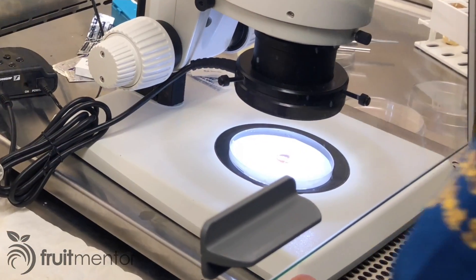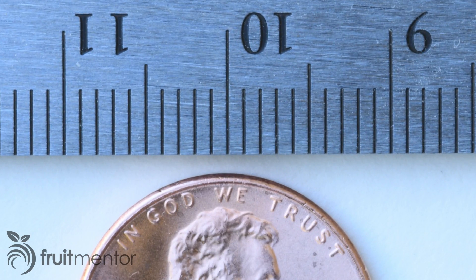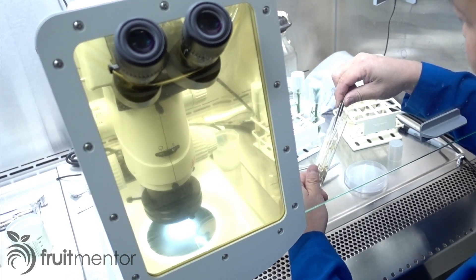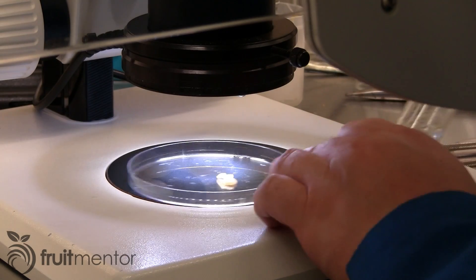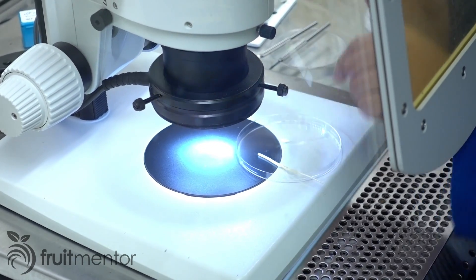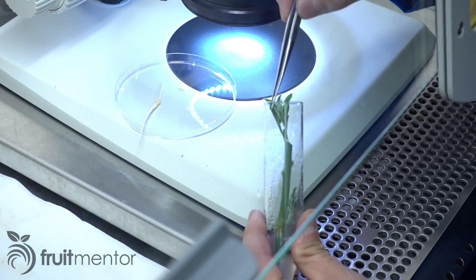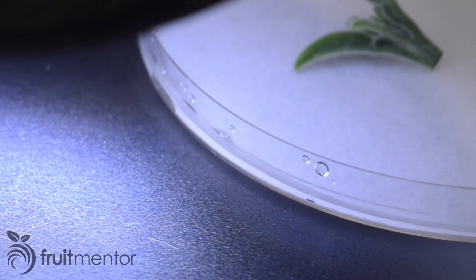A United States penny will give you a sense of scale under the microscope. First, the rootstock seedling is removed from the test tube and placed on a petri dish. The top of the seedling is cut off. Next, new growth of a shoot from the variety being introduced is placed on the petri dish.